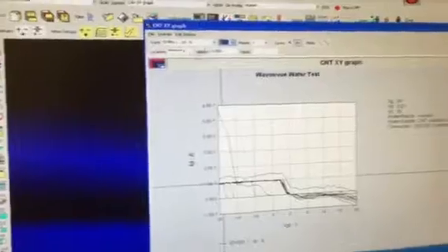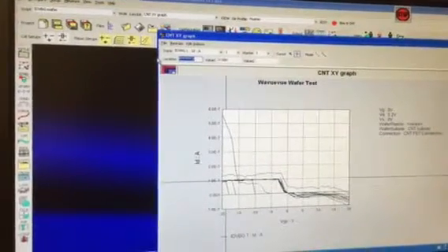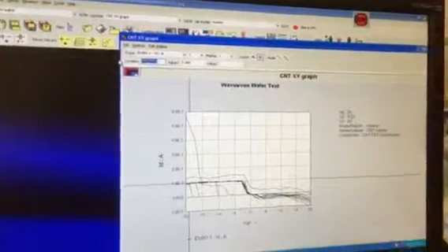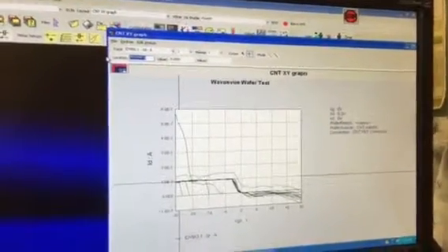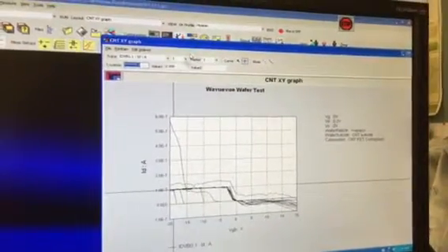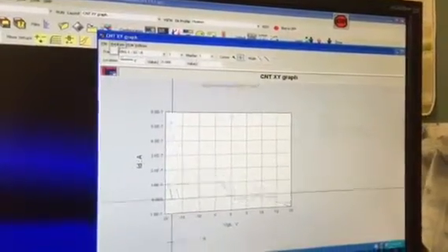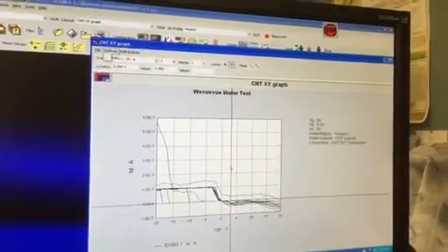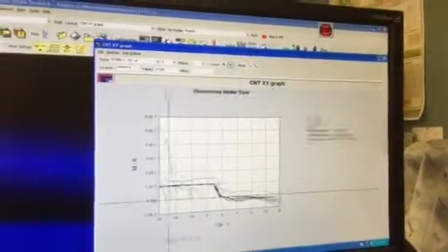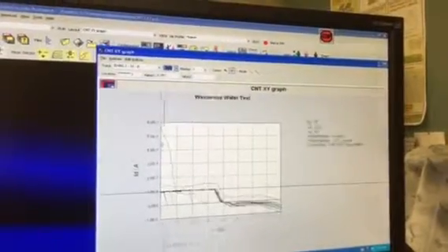And it doesn't, so I'm not sure why. Location. The location at -10. No. Okay, I'm going to have to look at that and see why. So it should be able to skip. I should be able to select the trace and know which trace I'm on.